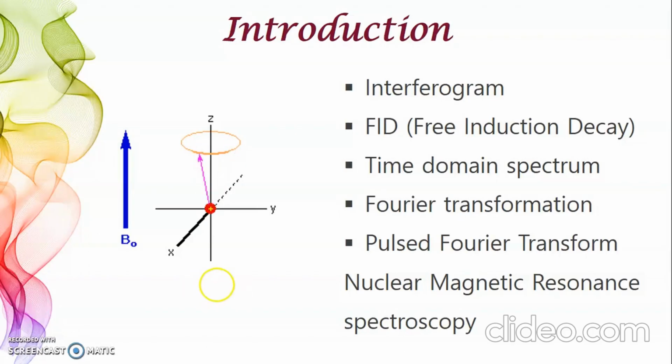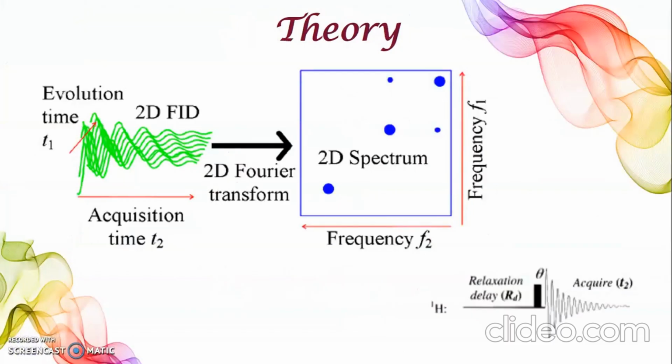We see the theory. In a pulsed spectrometer, the sample is placed in the magnetic field and irradiated with a pulse of high power radio frequency energy with a frequency range sufficiently large to cover the entire range. This pulse simultaneously excites all of the nuclei in the sample.